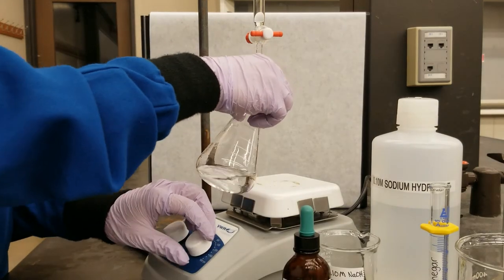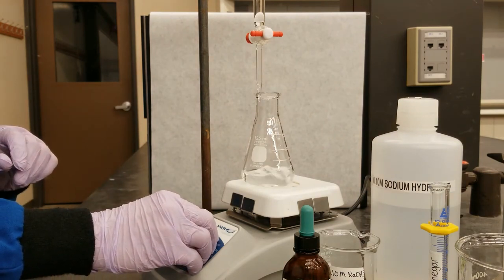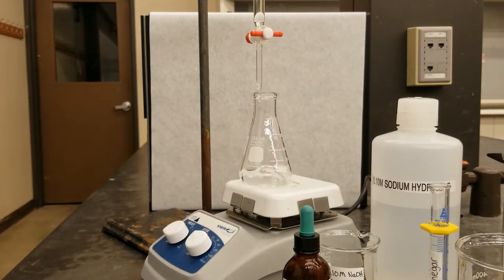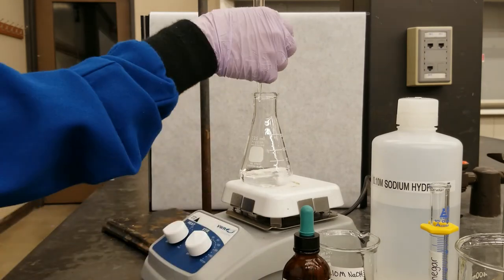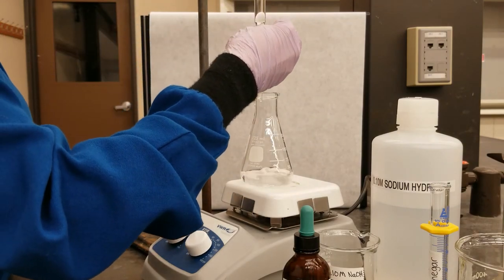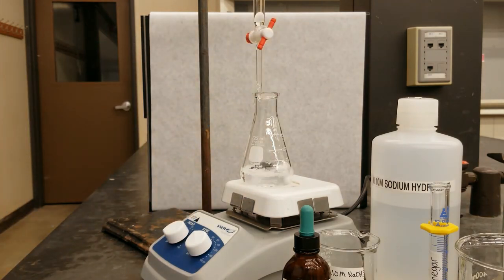And then I'll put my Erlenmeyer flask on the stir plate and let that mix just before adding my sodium hydroxide. And so I'll begin my titration with a big stream coming down. And I'll make sure to keep an eye on the pink color as it becomes more persistent.